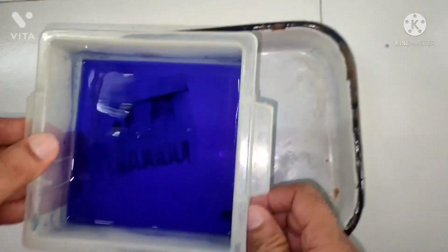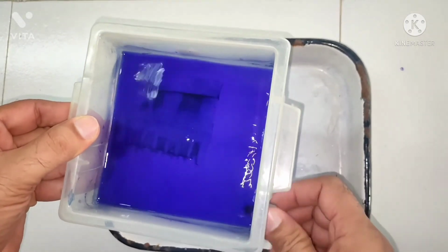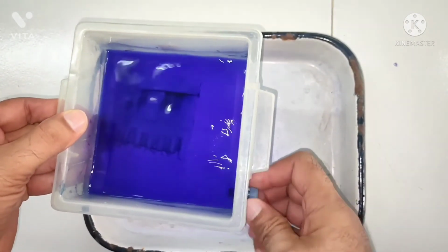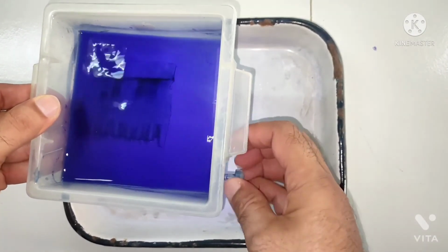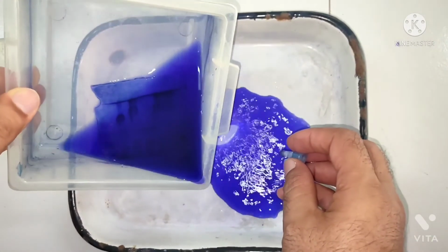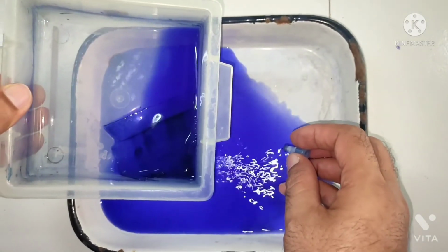See, now this is the gel which is kept in the destaining solution, and we kept it for approximately 2 hours, and after 2 hours you can see the status of the gel. So I am just taking it out, and we can also pour carefully like this.